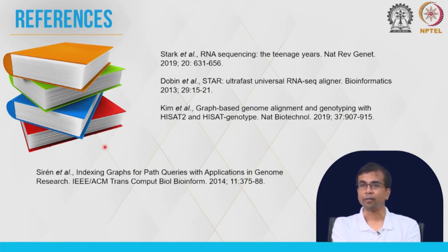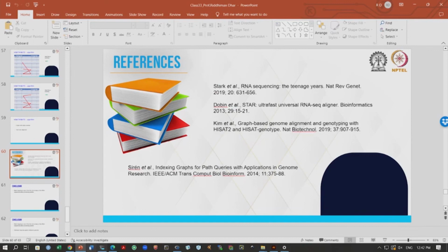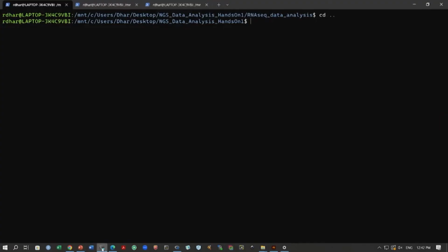What I wanted to do now is just show you the HISAT2 program before we conclude this class. So, I will go to this HISAT2 program now. Let us see.